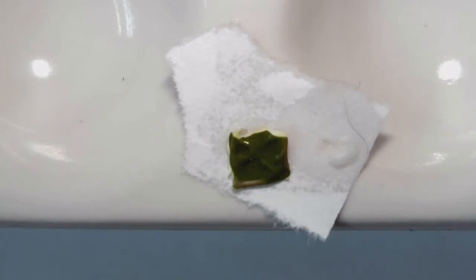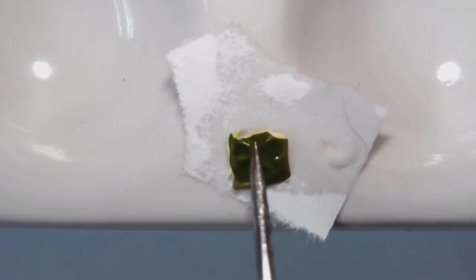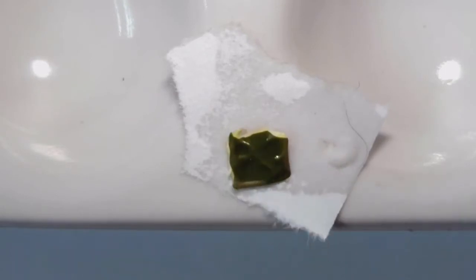And so again, some of these tests, it does demand some patience because it can take a little bit for the dry lichen to suck up that substance and then react. But we are already seeing just along the edge there in the medulla a yellow reaction. So this tells us that this is a K plus yellow because of the presence of stictic acid.